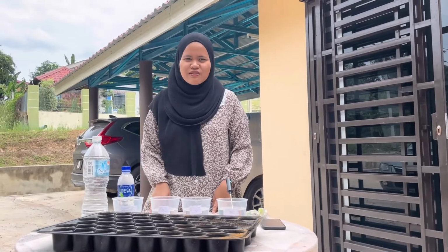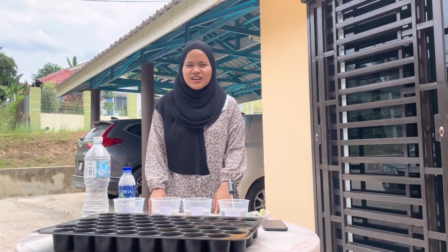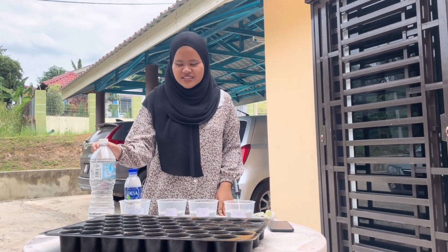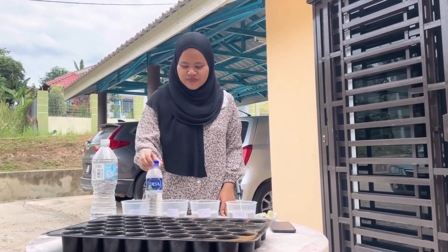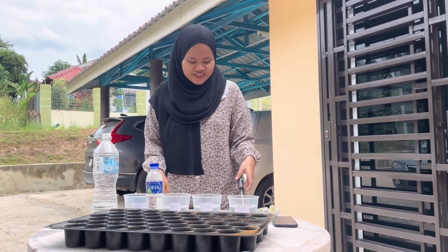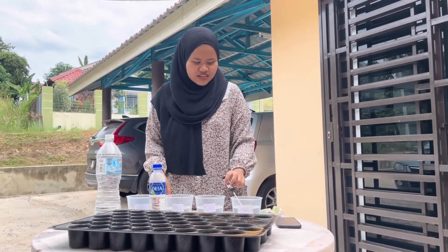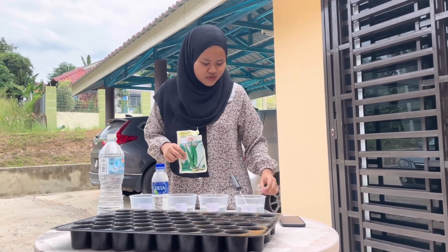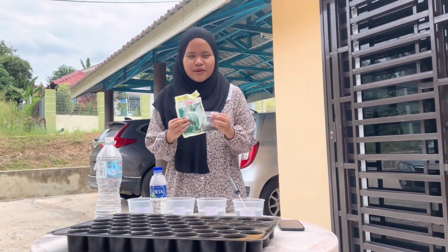Now I will show how I do my mini experiment. First of all, we have to provide all the material and equipment such as hot water, container, and thermometer. And the most important thing is 3 types of seeds.